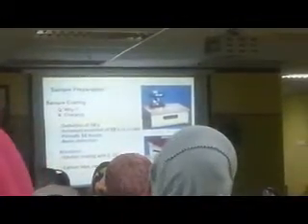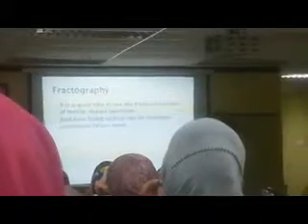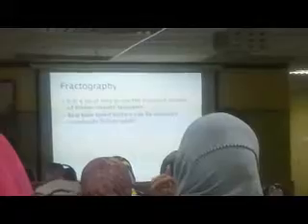And then lastly, we will see fractography. You can see fractured surfaces under SEM, and you can get a lot of information. Most of the time, when you do the tensile test, I know what students do. If this is the tensile test, you break it. So now you have two pieces. Then, oh, it's broken. Then you do this.